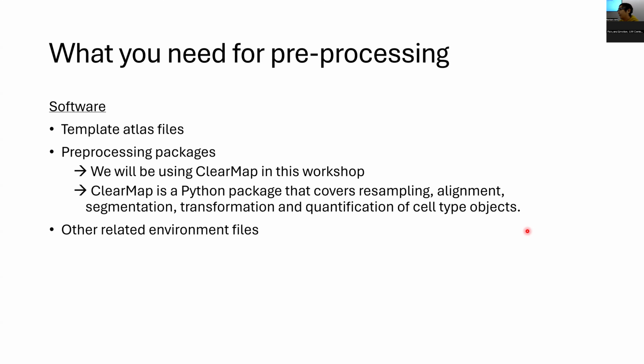It's a type of package that's kind of a wrapper. So it has very different modules or functions in one big package. You use the resampling function or the resampling module in this package to do that, and that, and that. So it's a very well designed, well organized package. One thing to keep in mind is that these packages are growing and being developed day by day, so there could be something better for you. But for today, we're just going to stick with ClearMap because it's well designed and we're used to it.